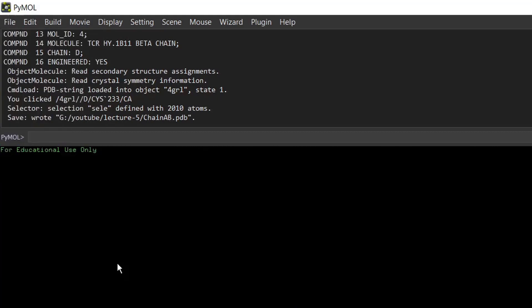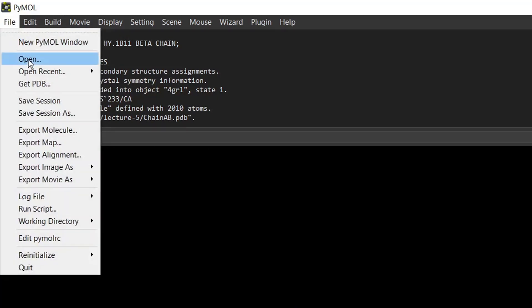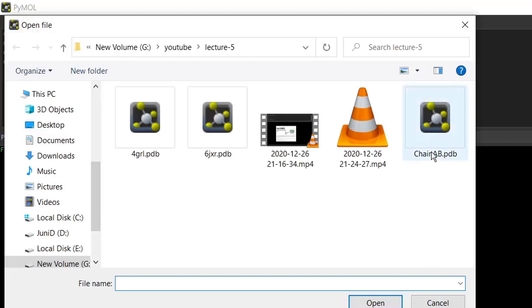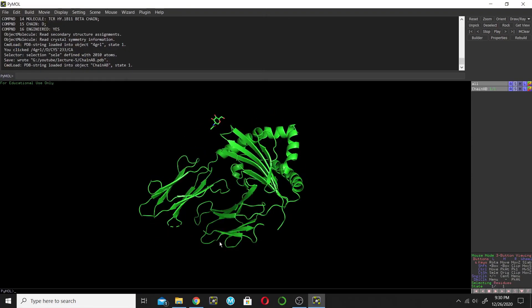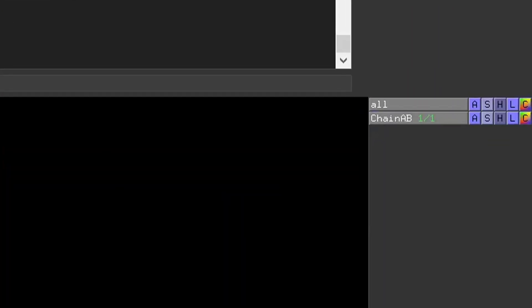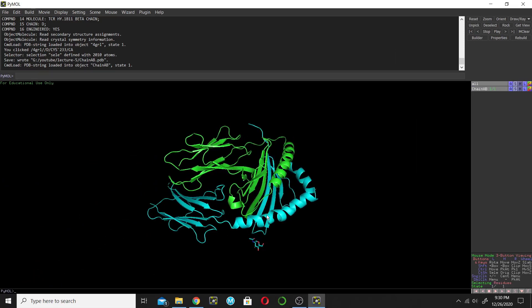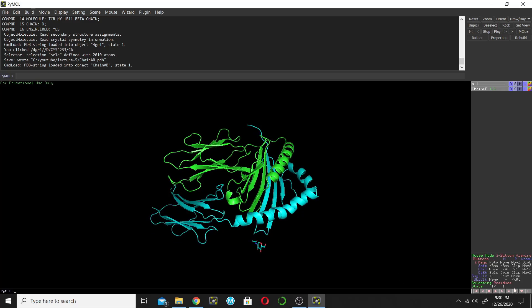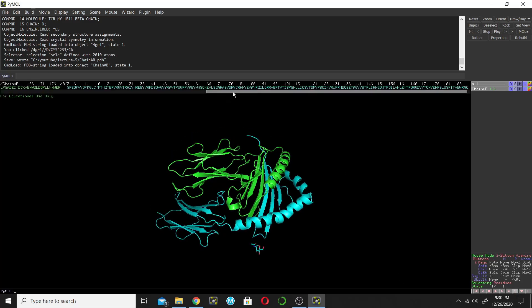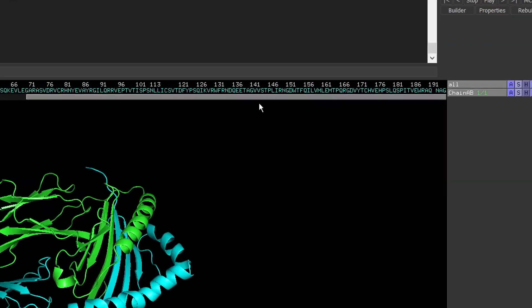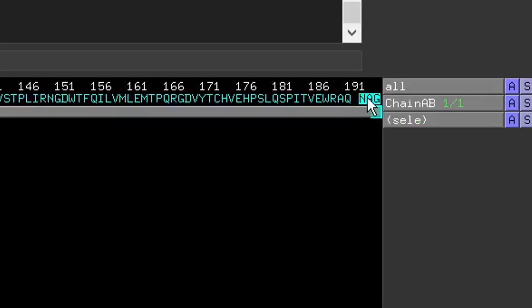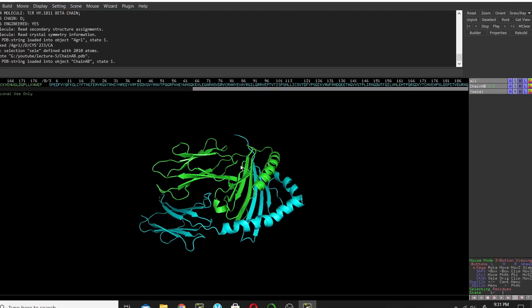I will check whether I have successfully saved these two chains. Re-initialize everything, then click Open and open the structure. Go next to All and click C to color by chain. Now go to the sequence view and check whether there is any other molecule. There is one ligand molecule in the structure — click on it, right-click, and remove it. Then you can save the final file.